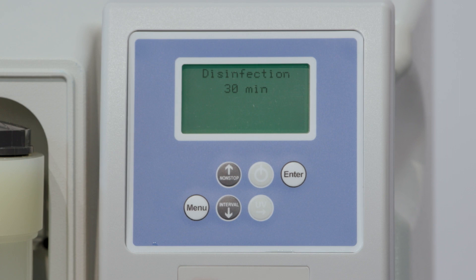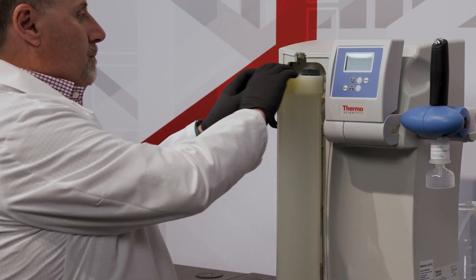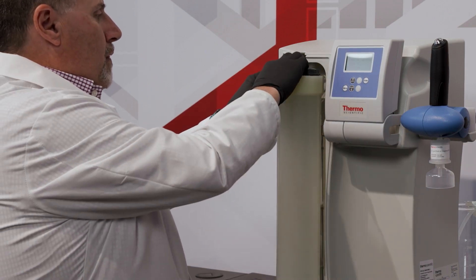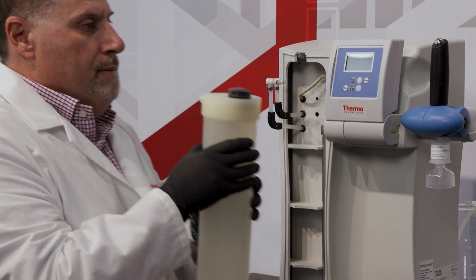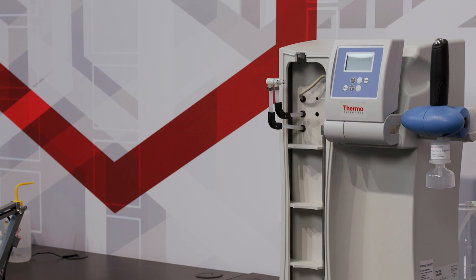When the cycle is complete, remove the disinfection cartridge and empty and dry it. Save the disinfection cartridge for later, storing it in a cool dry place. You're now ready to install a new UltraPure cartridge.